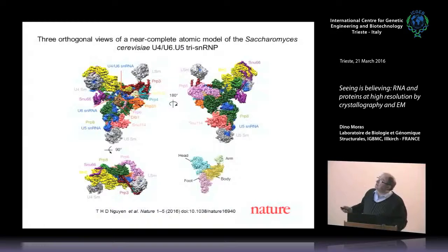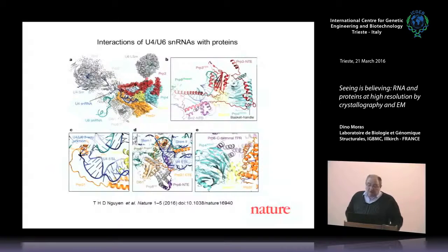Now the 3 orthogonal views of the same body. So that's the latest paper in Nature, the last month. And you see one view. I think the other one I have to speed up. At this point, you can start to look more deeply inside and look at interactions.